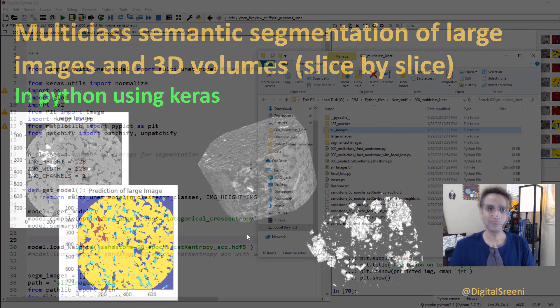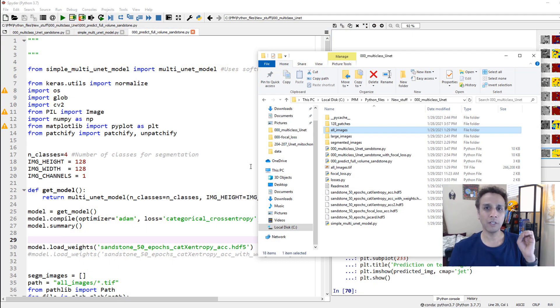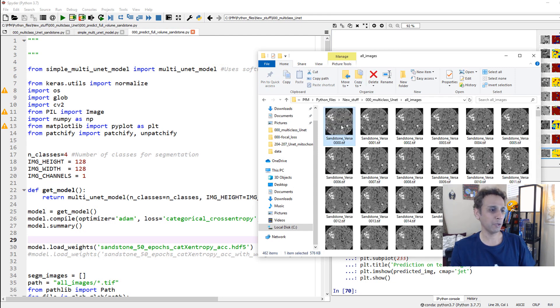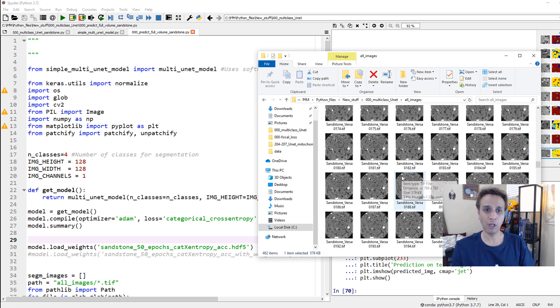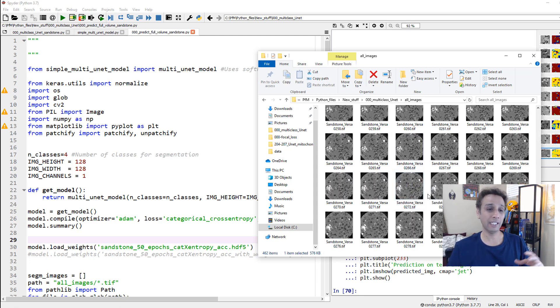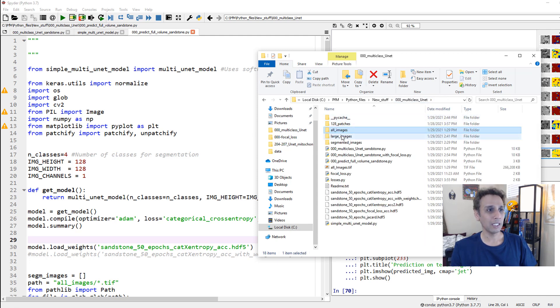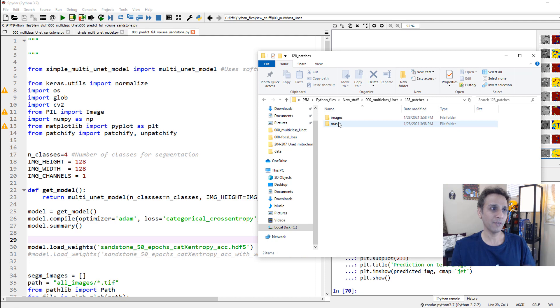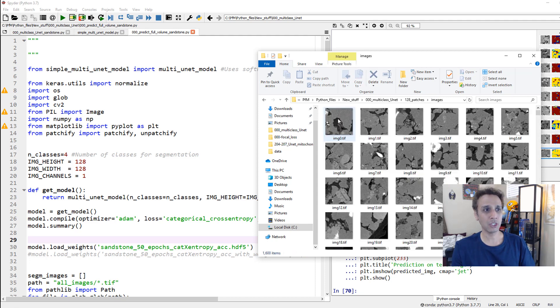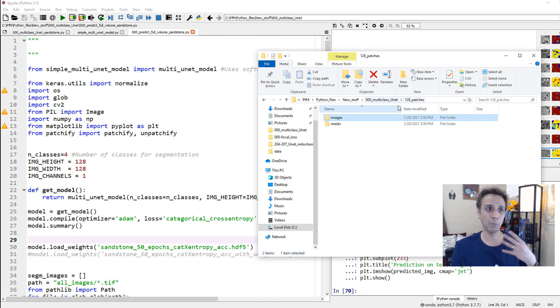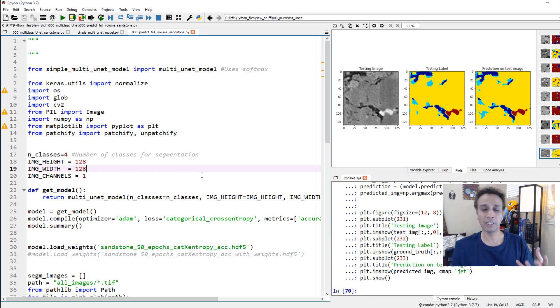Let's jump into the code. Just to give you a quick idea of my folder structure: I have a folder called 'all images' with about 462 images that make up this volume. My goal is to segment all of these and either save them as individual segmented images or stack them into a 3D TIFF file. From the last video, each image is 128 by 128 pixels, so our model was trained on these smaller patches - that's exactly why we need to divide everything into smaller patches.